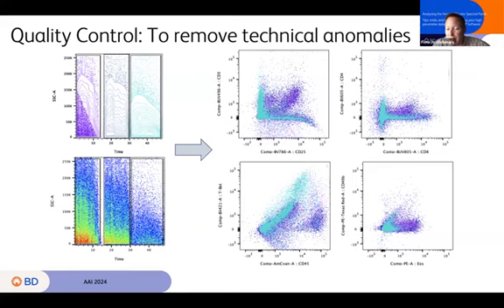And we really recommend that you do this algorithmically. People can look at the time parameter, make some estimates and gate them, some fairly obvious bad spots in this one, but that's a tedious process. And there are algorithms that can do it at a much finer level than I'm willing to do as a person going through all of my data samples.